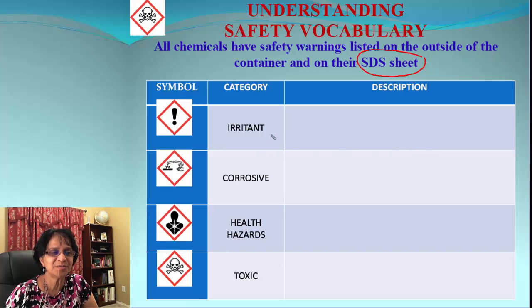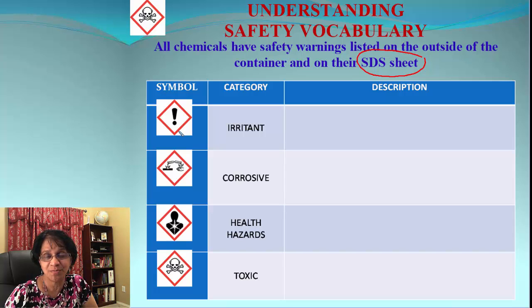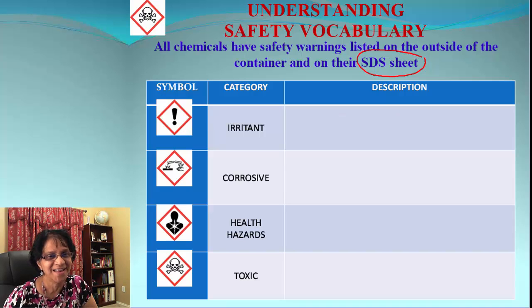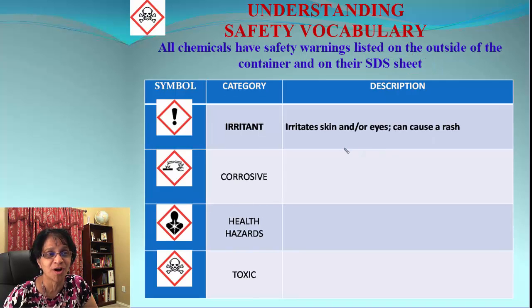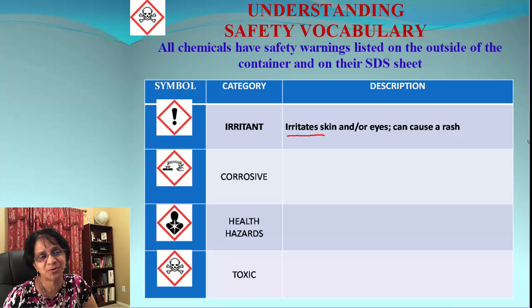The first term is irritant. Look at the symbol — it's like an exclamation mark, or if you think carefully, it may look like an upside-down eye. An irritant is a substance that irritates the skin or eyes and can also cause some rash. So stay away from irritants and be careful.